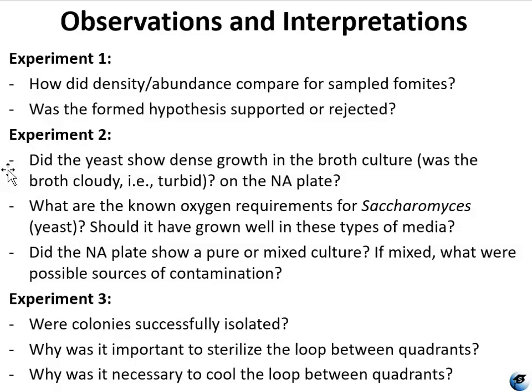You also are going to do a little bit of literary research because I want you to look up and see what the oxygen requirements are for Saccharomyces and if you should have expected it to grow well in the broth or the plate. And then for the plate culture, the simple streak, you want to have a look at the growth patterns and the morphologies to see if you actually did obtain a pure culture of yeast on your nutrient agar plate, or if you perhaps had some contamination and need to work on improving your aseptic technique.